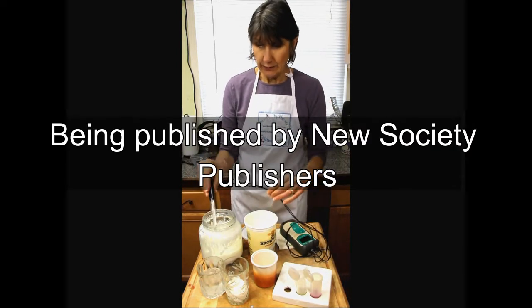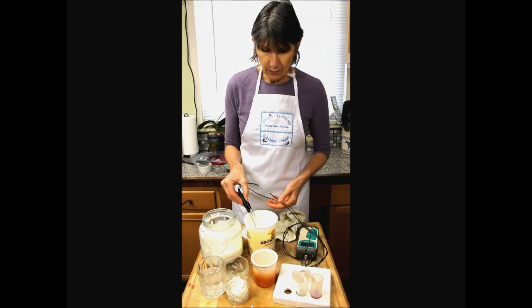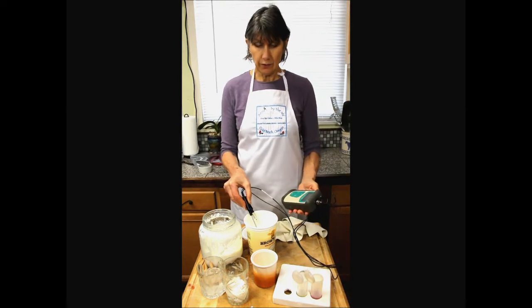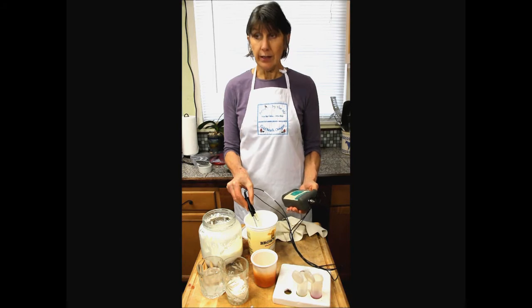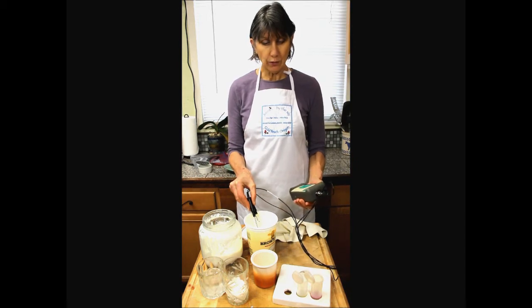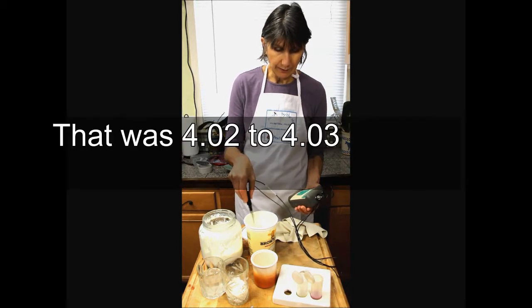Then, rinse the electrode, get that buffer solution off of there, and we're going to put it right into the curd of the yogurt. There is some whey separation in both of these, so there's going to be a little bit of a different pH in the whey than there is in the curd. And we'll see that in our little vat of cheese later too. So this is reading 4.02 to 4.03. And I'm going to swish it around in this little bit of whey. Let's see if we can get a different reading there.